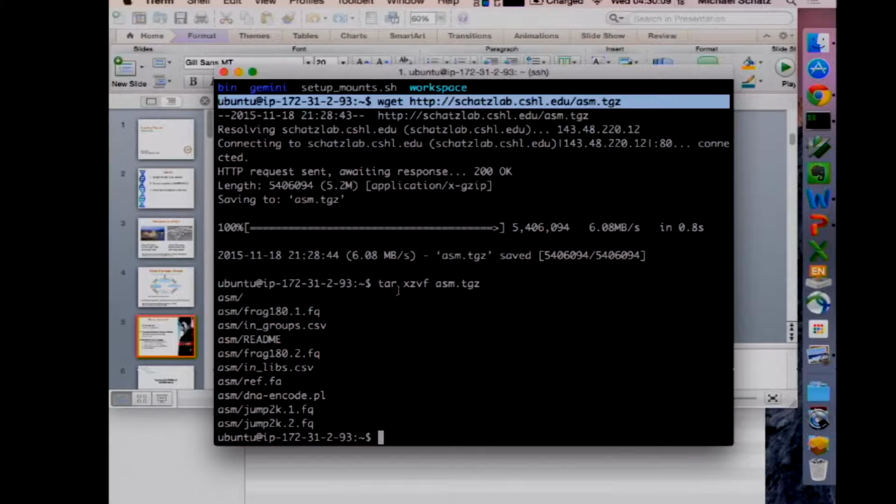So what I just gave you are a few things. We have a file here. It's a FASTQ file, frag 180. Again, ALLPATHS requires a fragment library where the reads overlap. So these are 100 base pair reads that come from a 180 base pair fragment. We also have a jumping library of 2KB mates. Again, these are these circularized molecules, extract the mates.